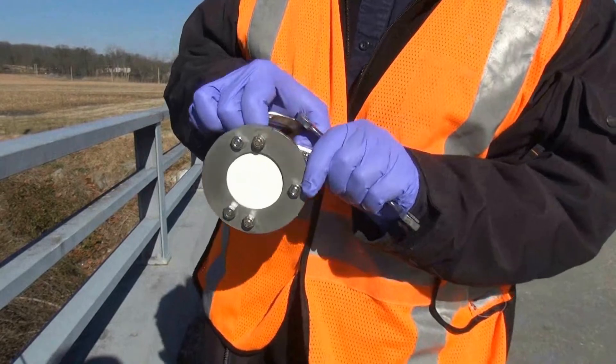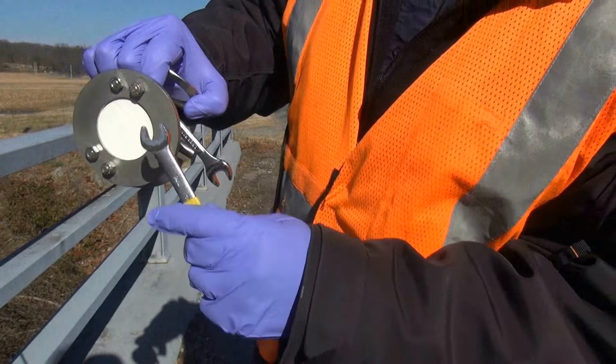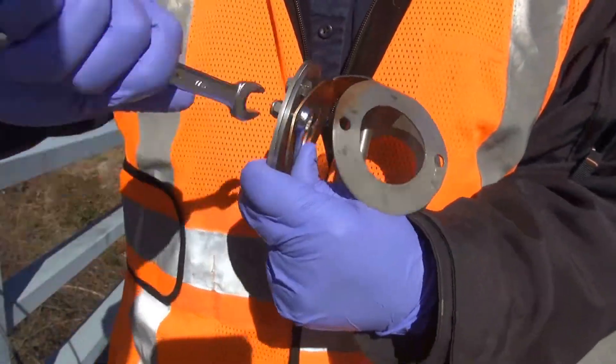Only handle the sampler by the metal ring, and take care using tools near the sampler that you don't puncture the membrane. Finding the right way to hold the wrenches may take some practice.